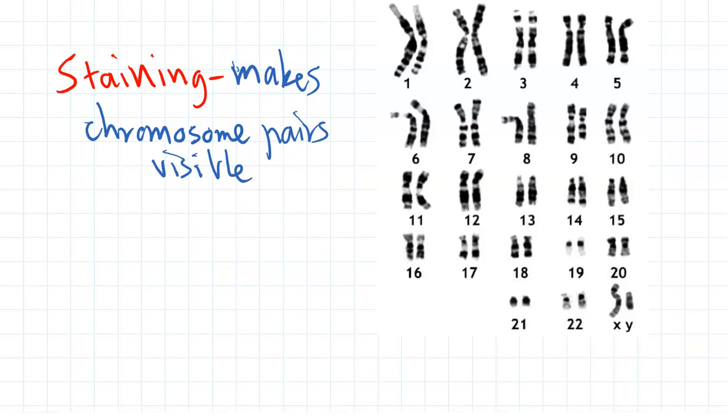And that's because you can see here, each particular chromosome has a particular pattern of bands on it. You can see this chromosome here has dark, then a light, then a dark band and a light band, dark and light again. So each particular chromosome gets stained slightly differently, and that makes it really easy to tell which two chromosomes need to match up into their pairs.